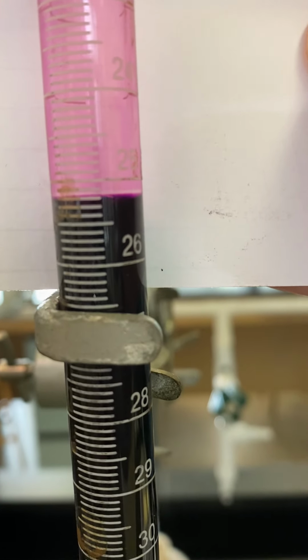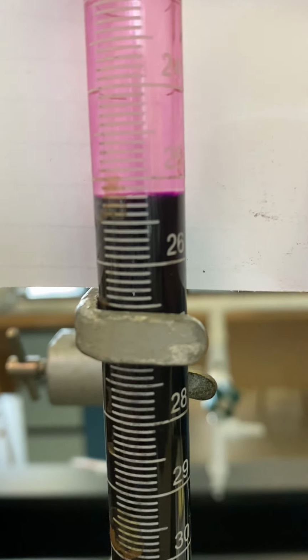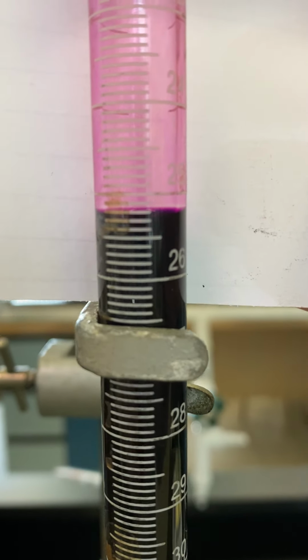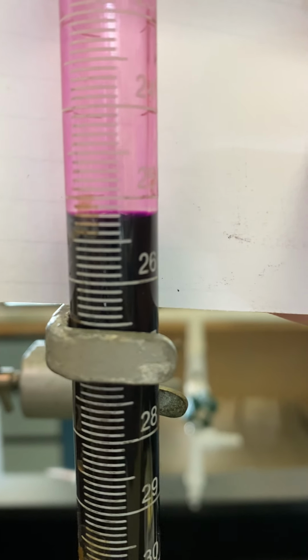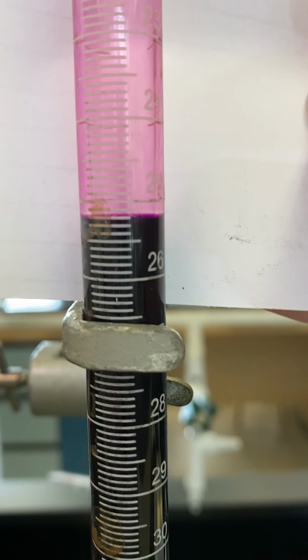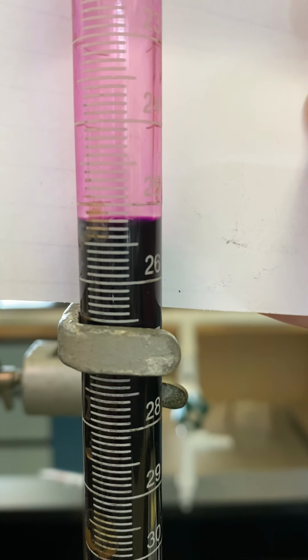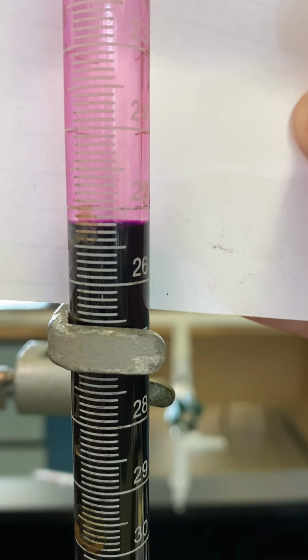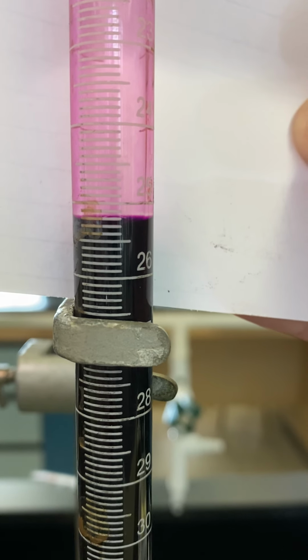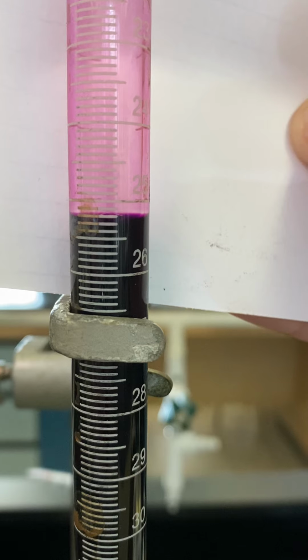You can see that the line on the burette is somewhere between 25 and 26 milliliters, much closer to 25 than 26. Now look, between 25.1 and 25.2, hard to tell because it's so dark.